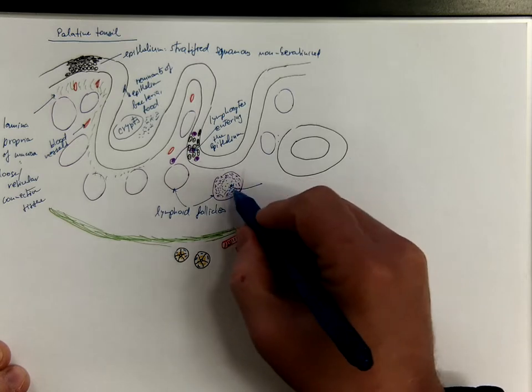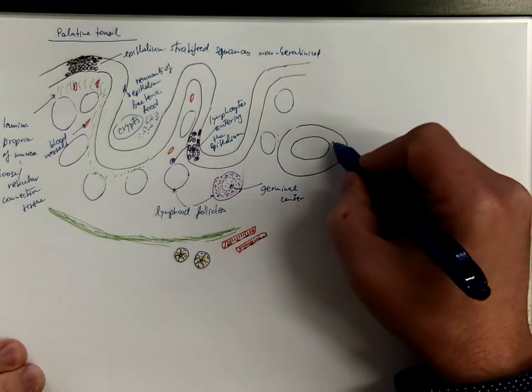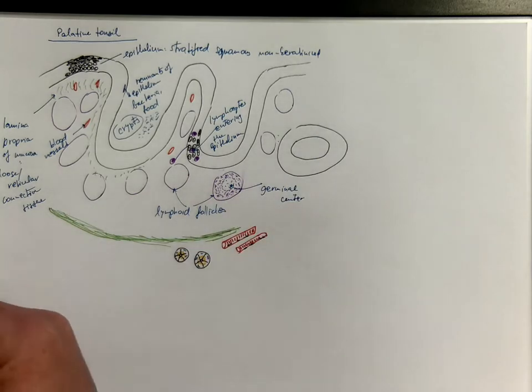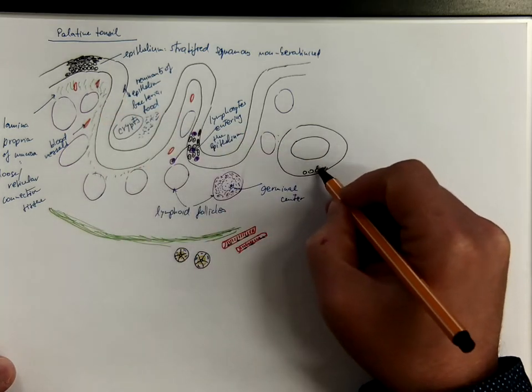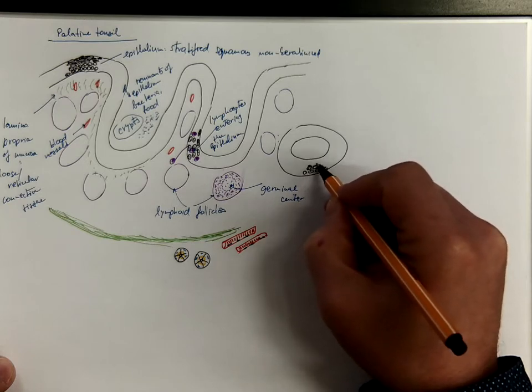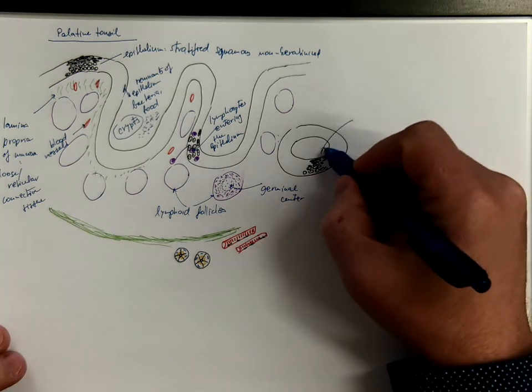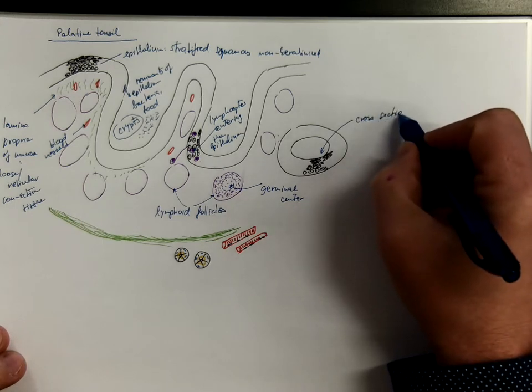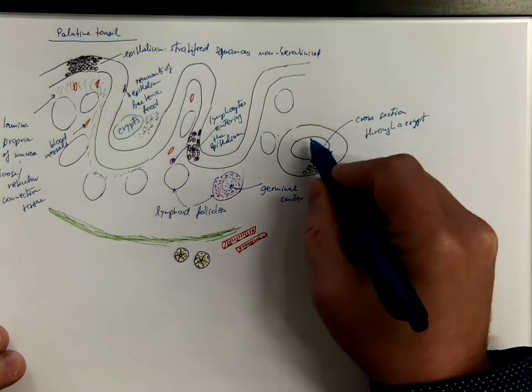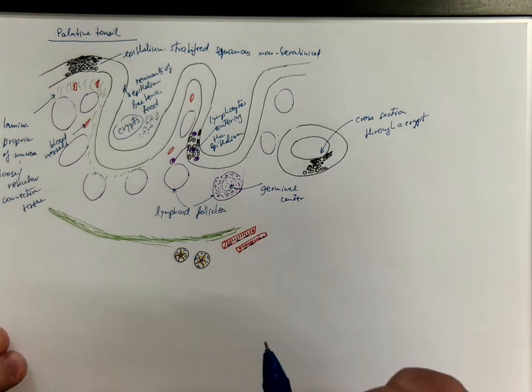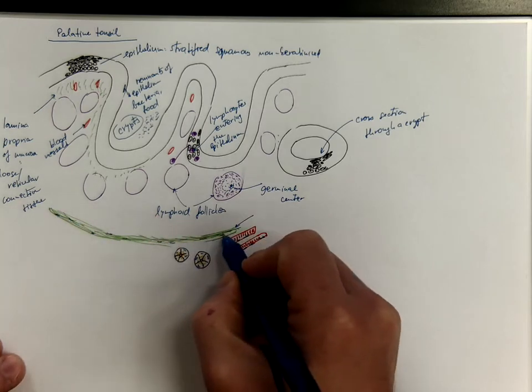Then you have these lymphoid follicles everywhere. Many of these have the germinal centers. And there could be these cross sections through the crypts. They could be easily identified because they have the same epithelium as this on the surface. So they got the stratified squamous non-keratinized epithelium. So this would be the cross section through a crypt.